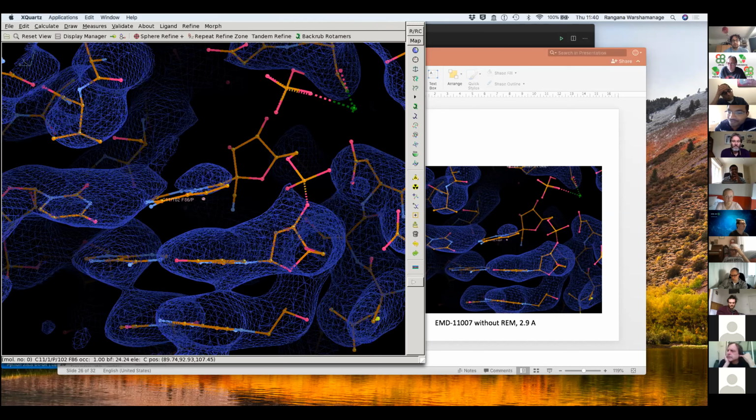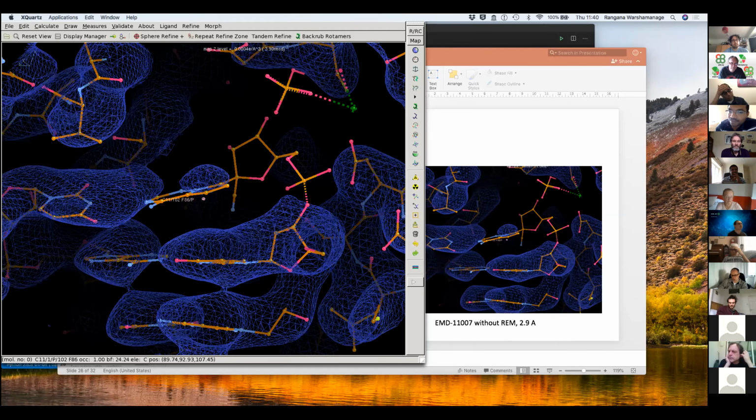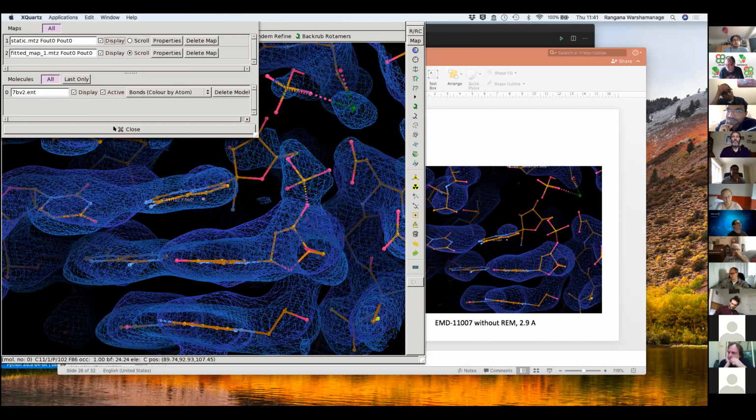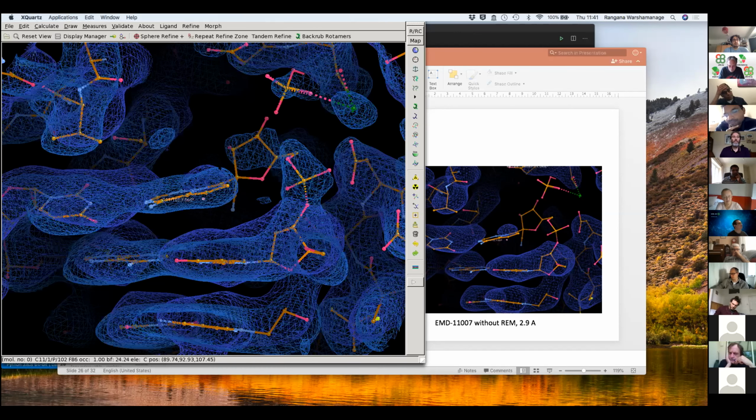I'm afraid that we need to check. That's what I was saying before, how the distribution of angles in the reconstruction was happening. I think the good place to look at is that nitrogen, the triple bond nitrogen. Does it make any interaction?